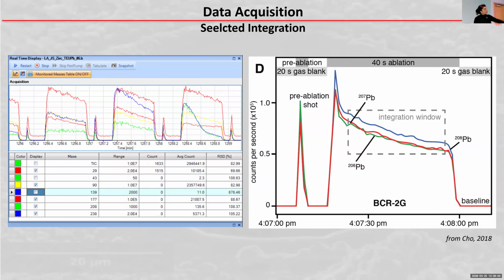Now, with the phases here, for instance, this is the pre-ablation. The so-called first peak is the pre-ablation, where you shoot with a laser. You use it as a little cleaning tool. You clean up your surface, and then you start the actual analysis. And then you will have this pattern while the laser drills deep, the analyte transport to the ICP-MS gets diminished, so you lose a little bit of signal, and then the laser stops again. So if you have a different phase, you can select which phase you want to look at and get the concentration data or the isotope data for exactly that phase.